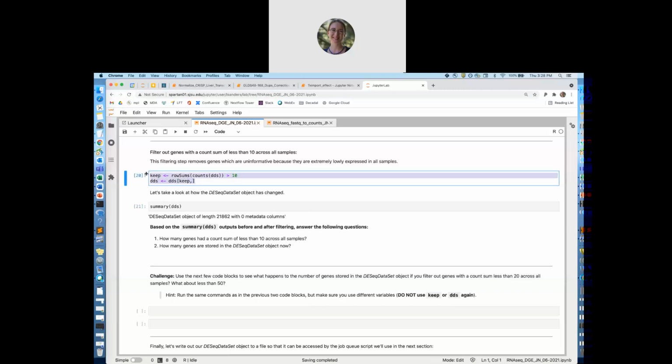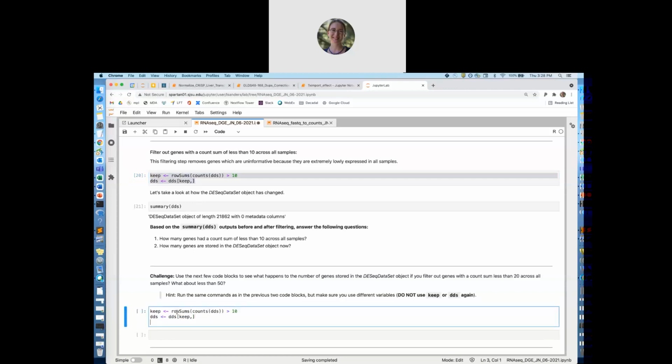If anyone gets an error, please feel free to share that as well. All right, let's walk through how to edit this code a little bit. Looks like some people have, do you want to share your code in the chat?